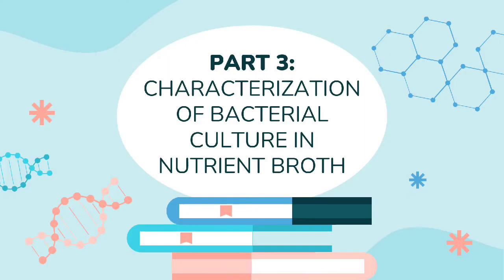The characterization of bacterial culture in nutrient broth. Nutrient broth is typically made of a powdered beef extract that contains peptones, or broken down proteins. The powder is dissolved in water, put in test tubes, and sterilized.